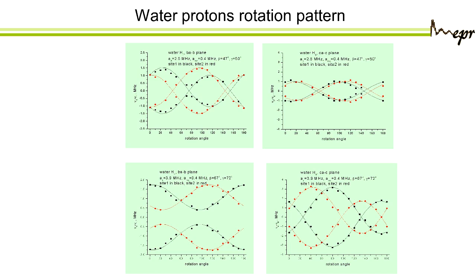And from this, you can extract the hyperfine isotropic part, the anisotropic part, and the angles with respect to the crystal orientation.